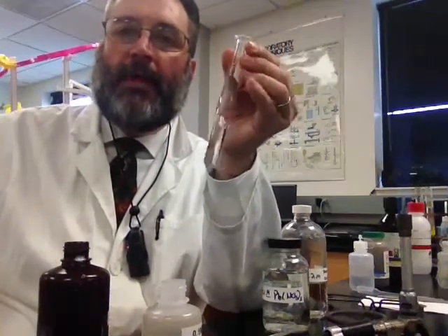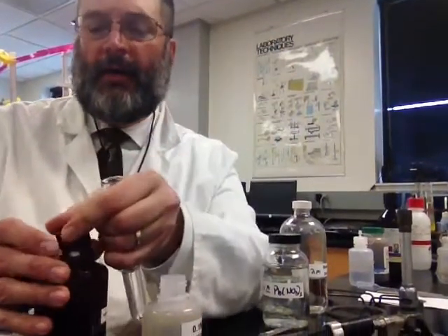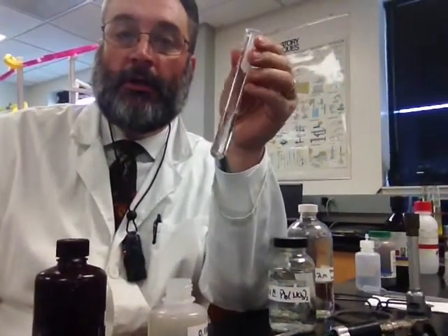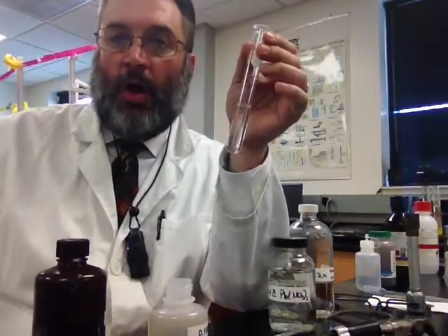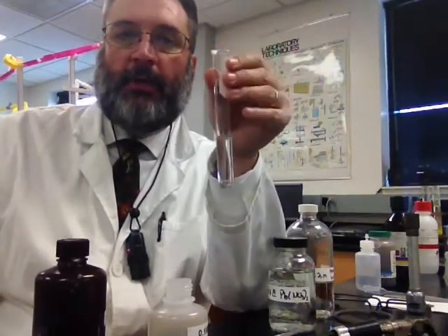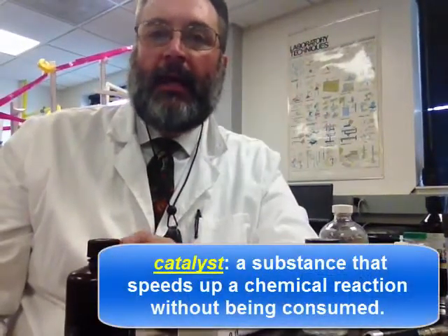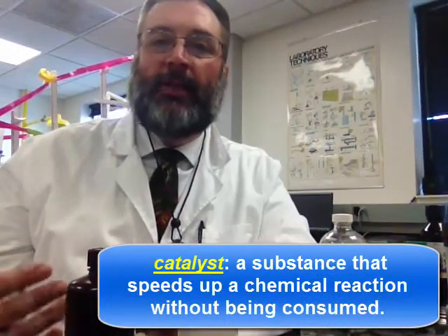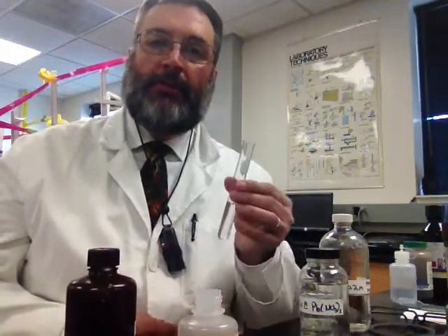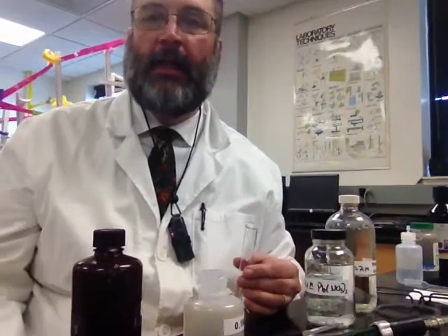So I want to speed this decomposition up. I want to be able to see it in a time so I don't have to sit here for a while. Even if I sat here all day, I wouldn't really see anything because the products of this reaction are also colorless and clear. So water and oxygen, you can't really see those, right? But if I can speed it up enough so that I can see the oxygen being produced, that'd be cool. So the way I speed up a reaction is I need a catalyst. A catalyst is a chemical that speeds up a reaction but isn't consumed in the reaction. Okay? So the catalyst that I'm going to use for this reaction is called manganese(IV) oxide, or sometimes it's called manganese dioxide, MnO2.